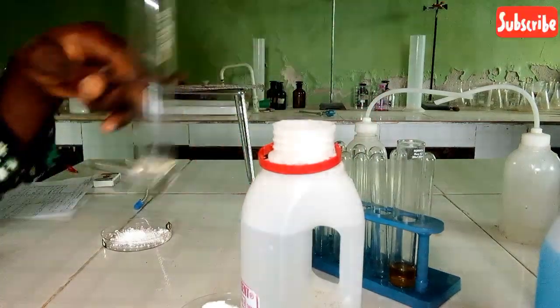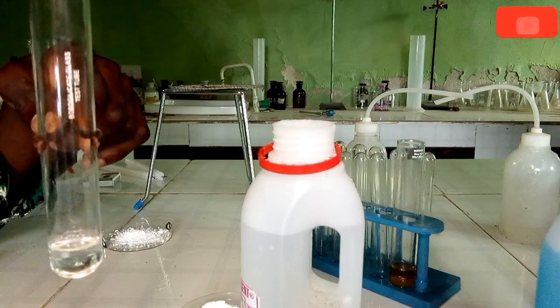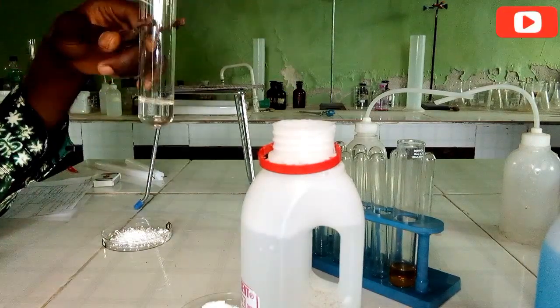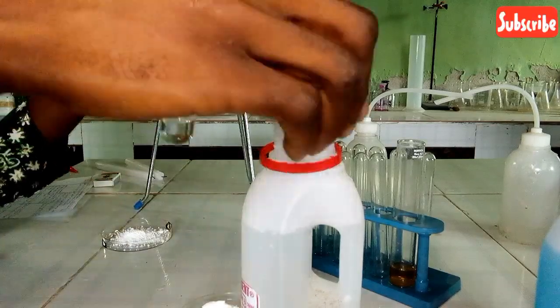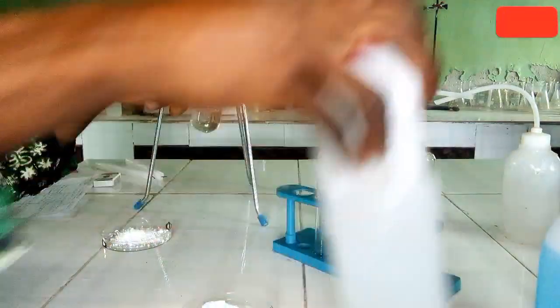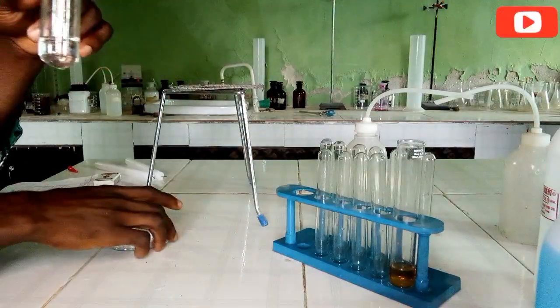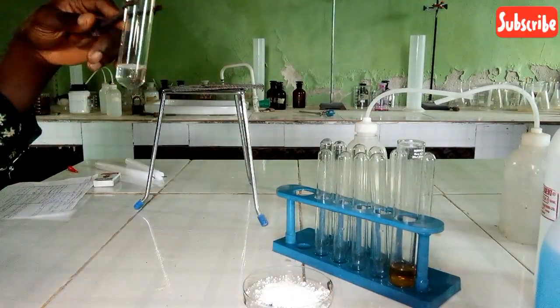So when we add Fehling B, is there any change? No changes yet. Then the question asks us to heat the mixture, so let's go ahead and heat it. In the absence of a Bunsen burner, I'm going to improvise in a very funny way.